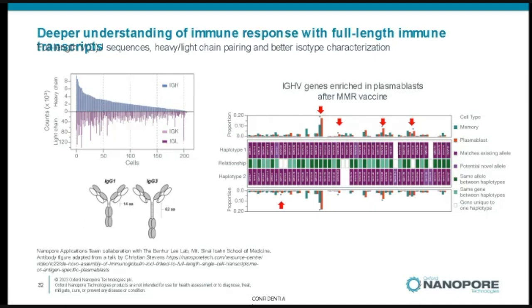In addition, one big advantage they found is that better antibody isotype identification is obtained when doing long-read sequencing. You can see in the image on the left bottom that we are able to identify the IgG1 and IgG3 antibodies and the changes in the hinge region. This region is not covered well by short reads, and the authors found those isotypes were often misaligned. By using full-length reads, they are now getting unambiguous isotype identification.